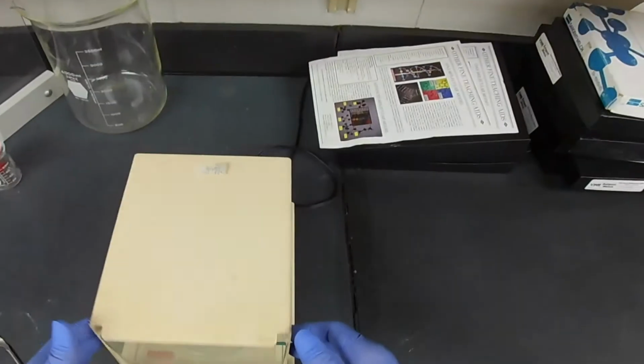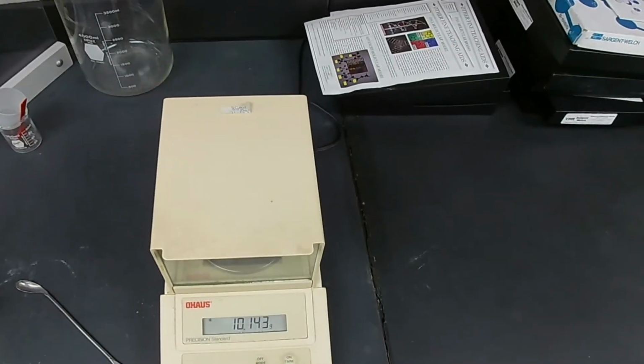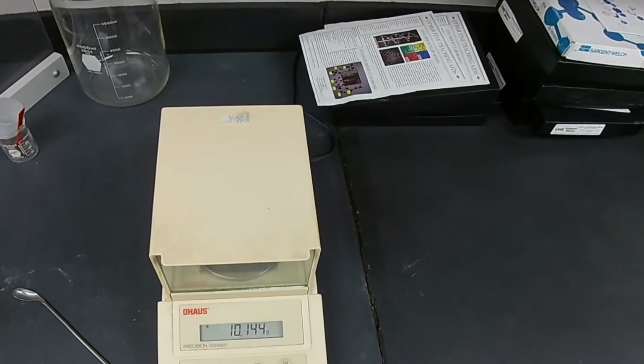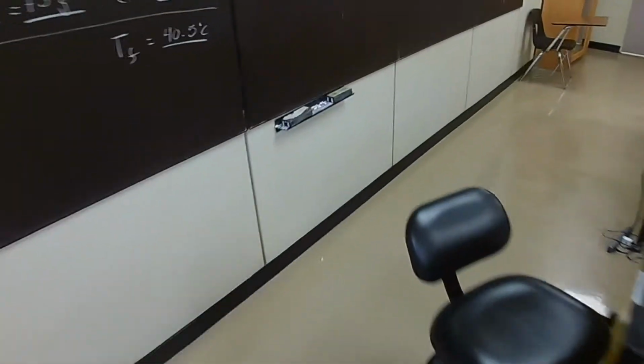Close the lid and determine the exact weight. 10.144. 10.144 grams of sodium carbonate.